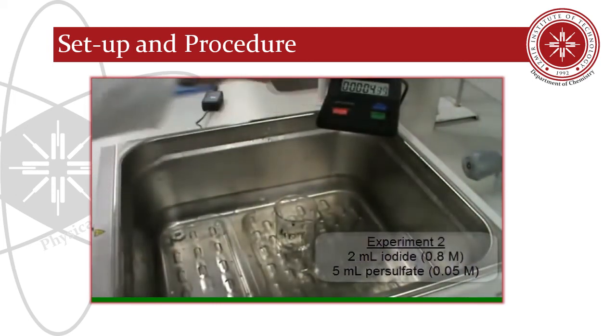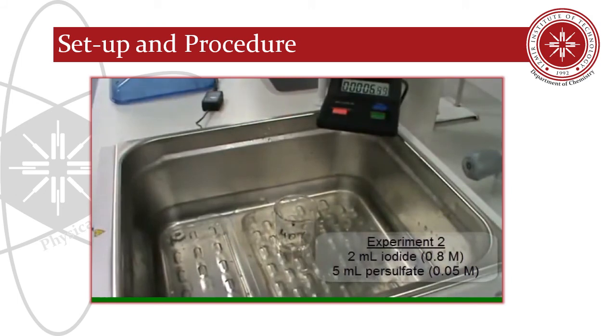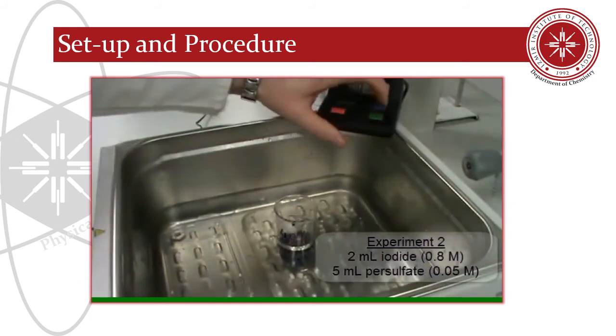So we saw when we cooled it down, the rate very much slowed down. The time taken was much longer. Now we're heating it up, and we're watching this in real time, and we'll see obviously that the rate is going to be much faster, the time taken much shorter.